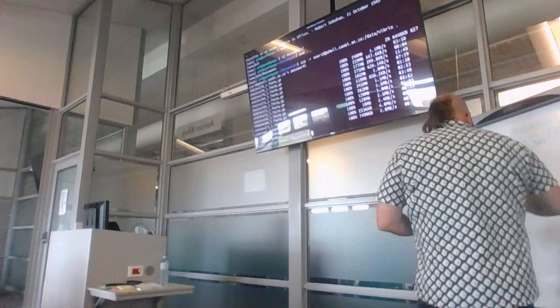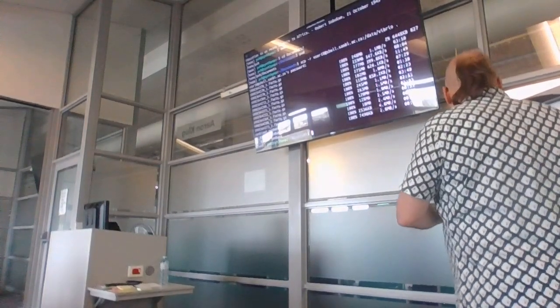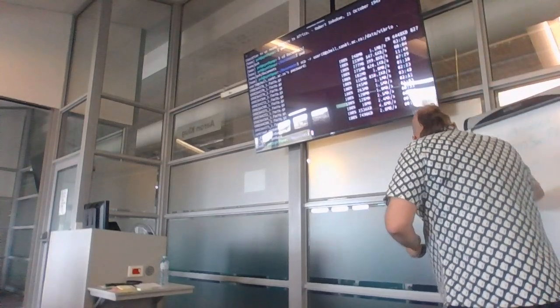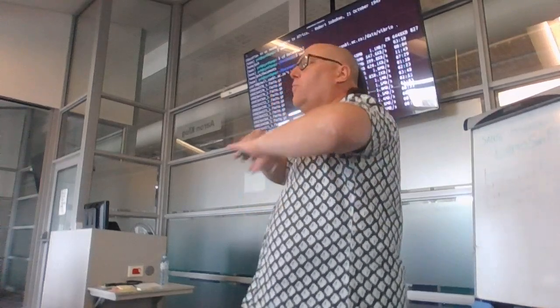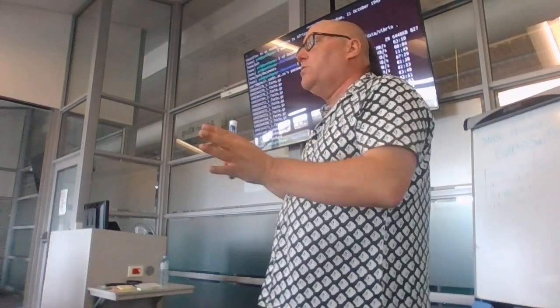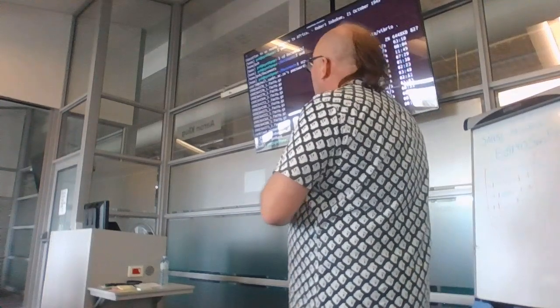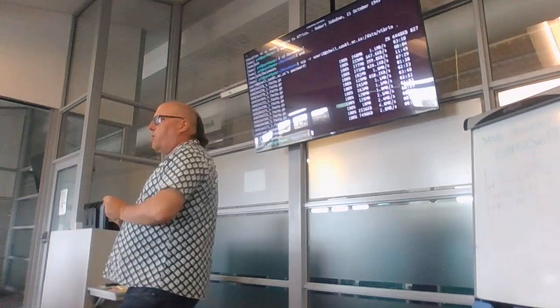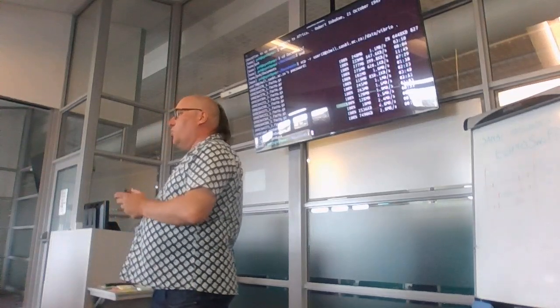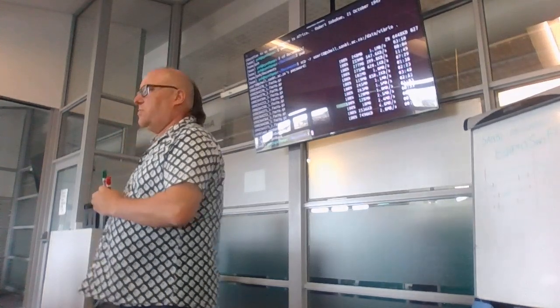So this is the basic approach. The end result is that your final genomes all end up being the same length as the reference. Because we've taken the reference and we've just inserted, unless we're putting insertions and deletions in, but let's assume that we're putting just the single nucleotide changes in. Great. All is perfect. How many chromosomes does Vibrio cholerae have? 2. The cholera people know. Vibrio cholerae has 2 chromosomes.